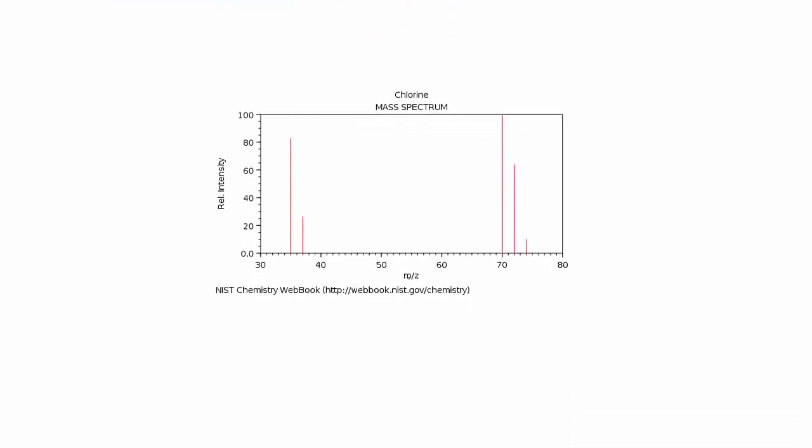Now first of all, I just want to look at this term m/z. m/z is the mass-to-charge ratio. Earlier on I said that we can assume the charge is always going to be plus 1, because that's one of the assumptions that we make. So taking that into account, it's always going to be m over 1.